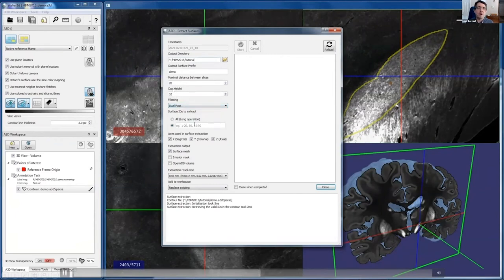Basically, if you haven't annotated up to small areas at the end and you're working on a single axis, then the cap really is the extrapolation part. If you're annotating multiple surfaces, it will do all of them unless you specify one. The filtering is really a very basic smoothing that you can pick an amount of.